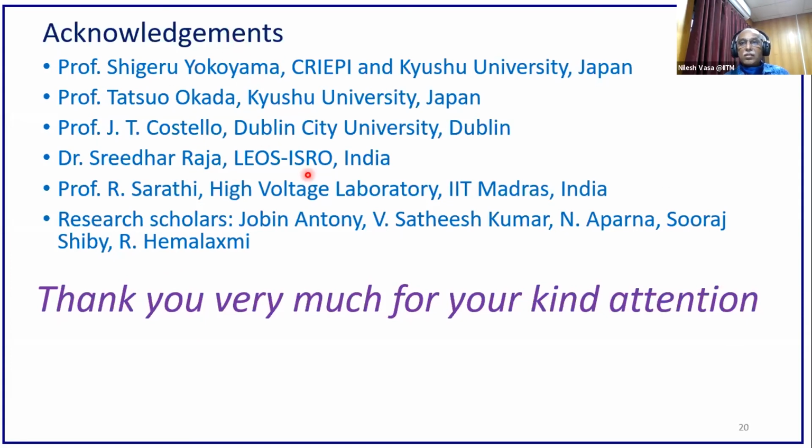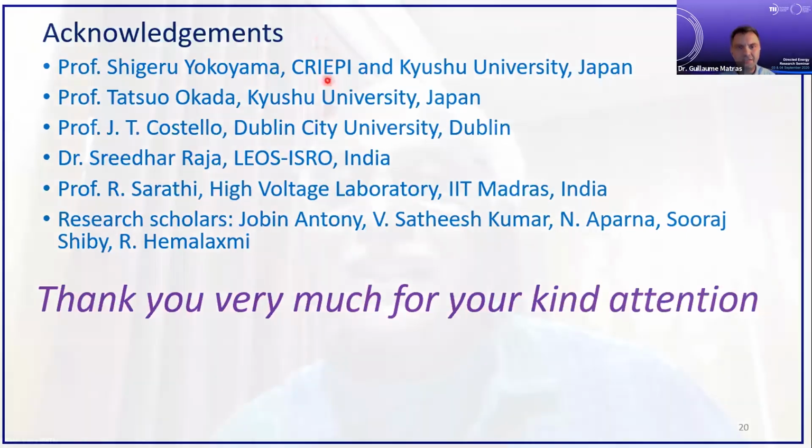Okay, thank you very much, Professor Nilesh Vasa. It was very, very interesting. So when using LIBS, how to distinguish the noise from the elements ablation or the optical imagery of the plasma plume or optical plasma emission feeding the spectrometer?